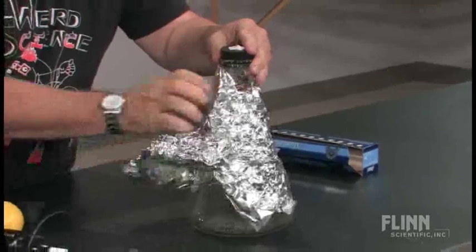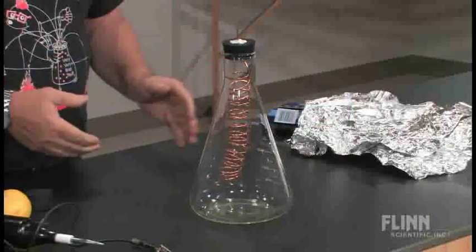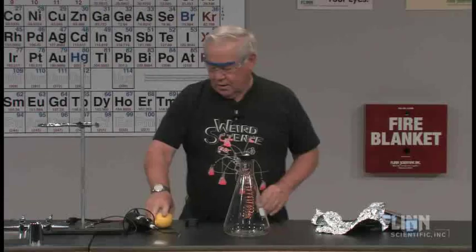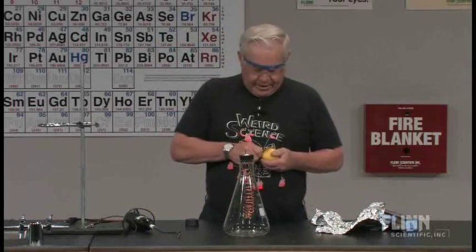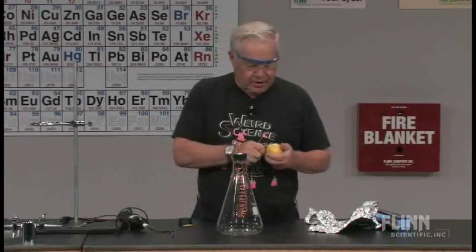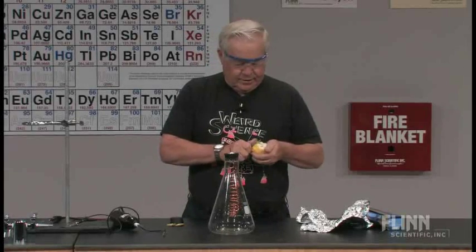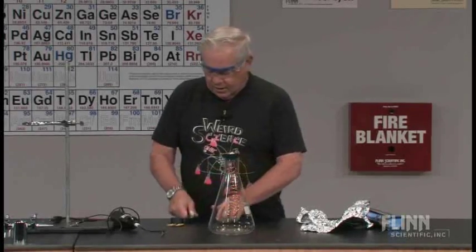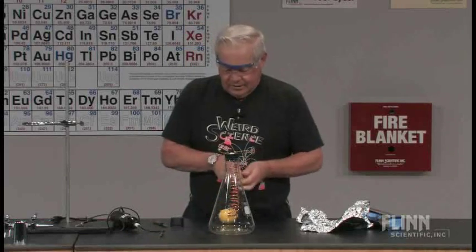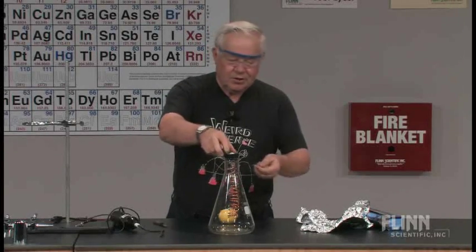Let's take away our aluminum foil. Originally we had O2 — we couldn't see it. I believe we have O3 now, but we can't see it either; both are invisible. Lemon peels have a chemical in them called limonene. Limonene is a fairly large unsaturated hydrocarbon, and limonene can get oxidized by ozone. So I've got some peels here, I'm going to break their surface just a little bit, and I'm going to drop the limonene in and put a new stopper on top. We're going to see what happens inside the flask.